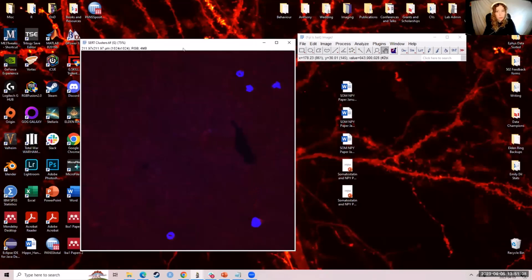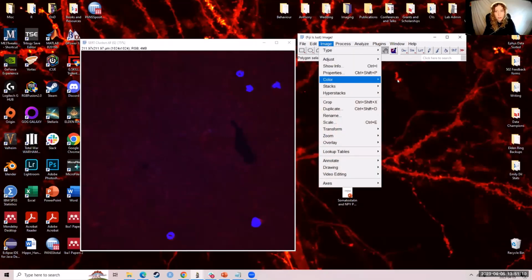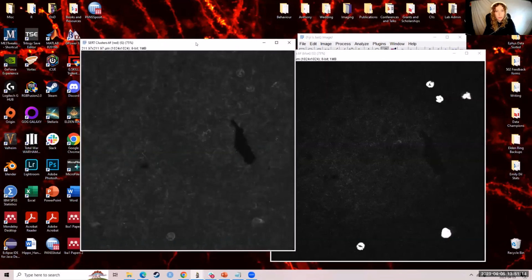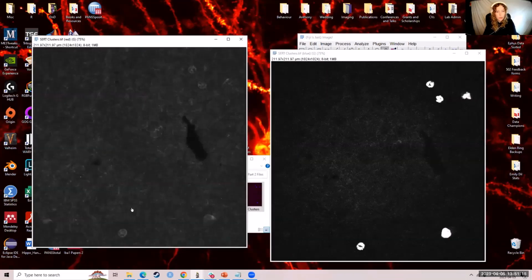Image, color, split channels. Great. We want this channel and we want this channel. So now you can see where the red is around these cells.